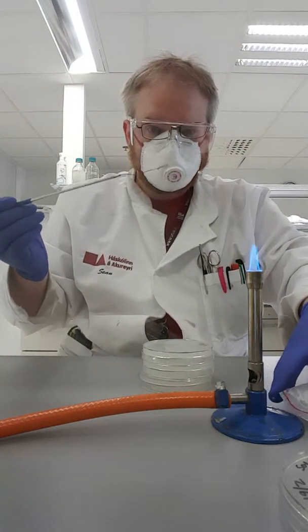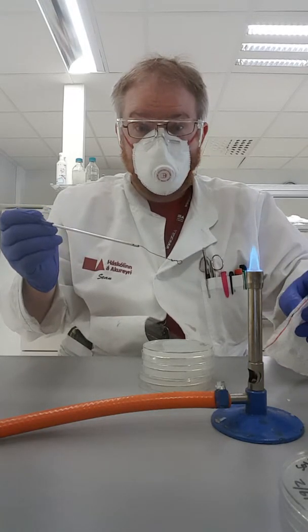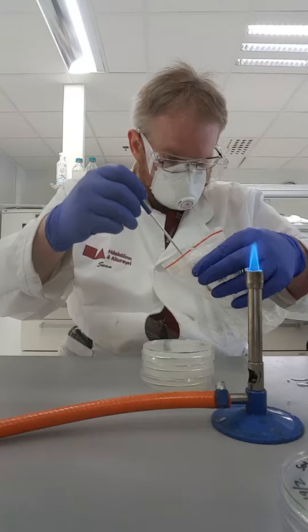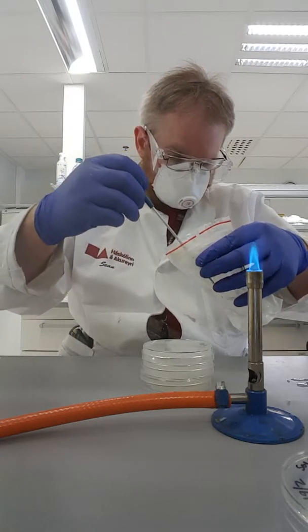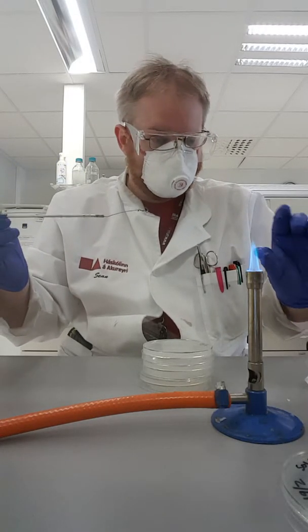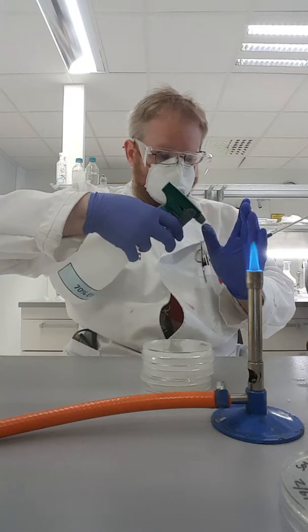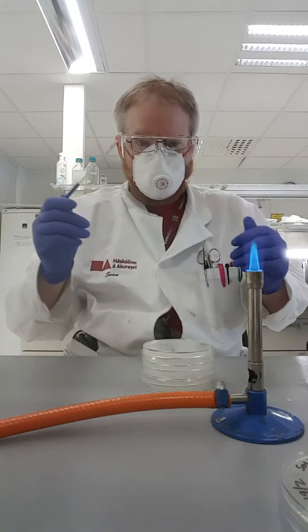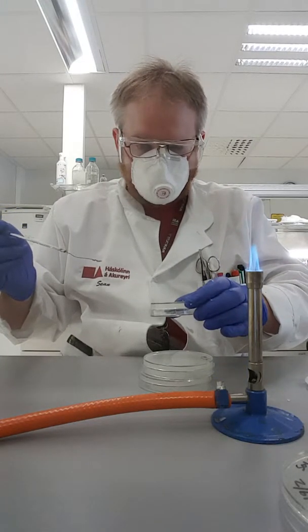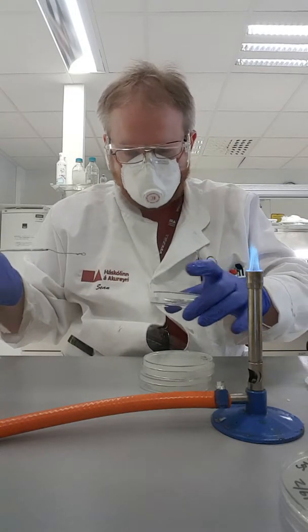So I go back to my sample — if I can get the bag open, that seems to be a problem. There we go, I got some sample. Clean my hands really quick. So now I'm going to do the same thing again, except this time I'm just going to make a lawn, where I basically just streak it out all over the surface of the plate, just so I can see what grows — just for fun.